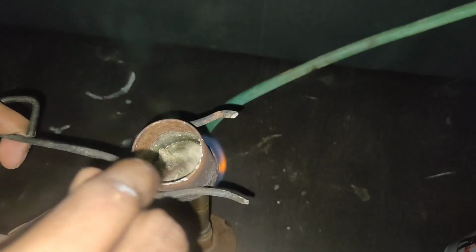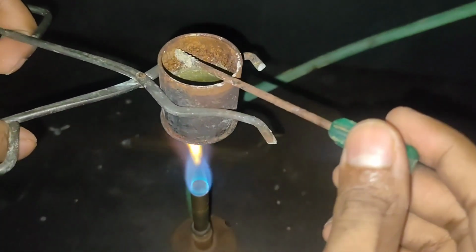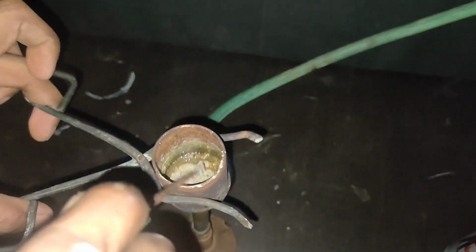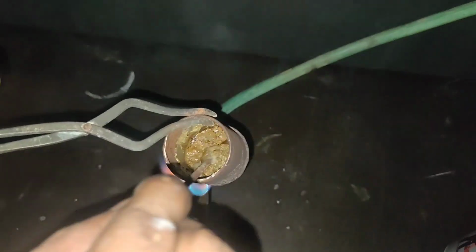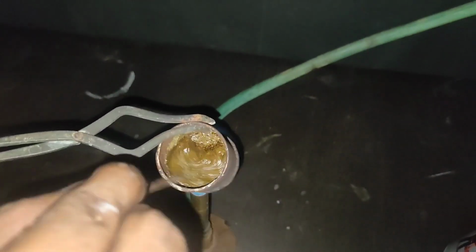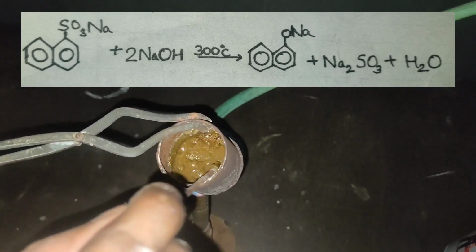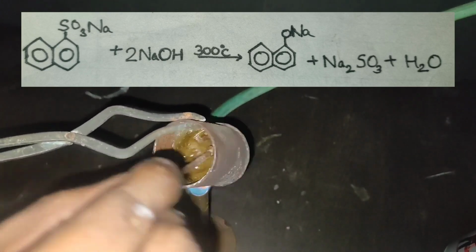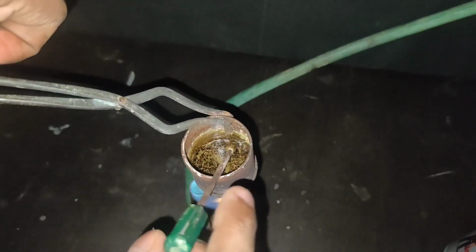After some time, things started melting. So the reaction which is supposed to occur is that the sodium naphthalene sulfonate is reacting with sodium hydroxide to produce sodium sulfite and sodium naphthoxide.